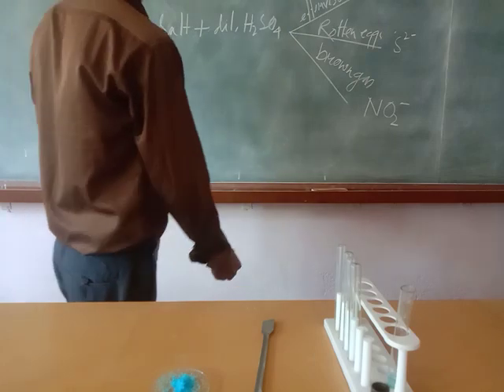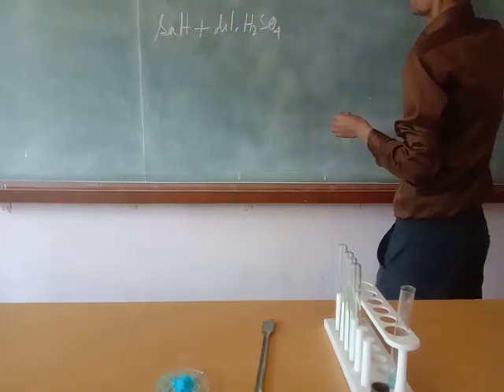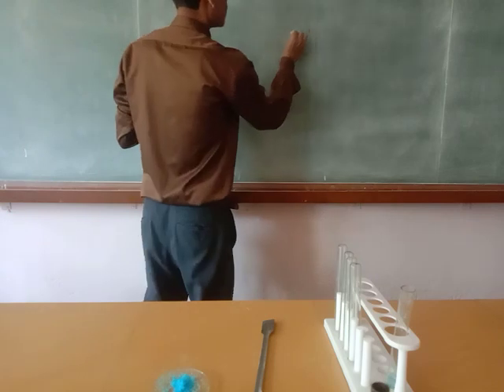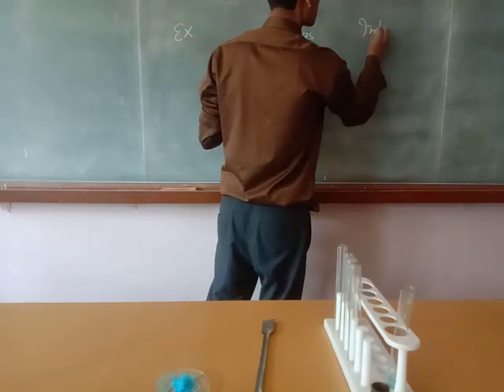So simply here you write this is the experiment, observation and inference.